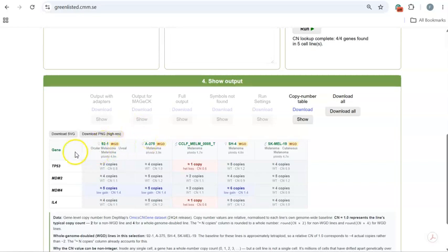And what you see then is, first of all, the copy number here is the sequencing data. And keep in mind that this is a large scale sequencing effort. These cell lines could have a mixed genotype, so it will never be a perfect number of copies here. So this information is more informative for you to know if there is a major difference or not.